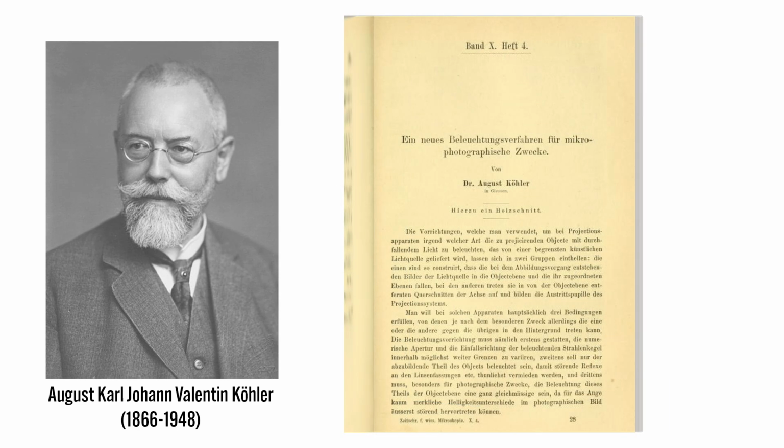Kohler's groundbreaking approach was published in an article titled "A New Illumination Method for Photomicrography Purposes" in the journal Zeitschrift für Wissenschaftliche Mikroskopie, or the Journal of Scientific Microscopy, in 1893.